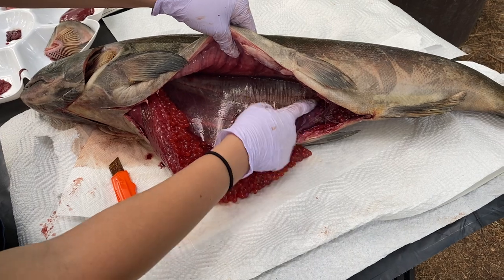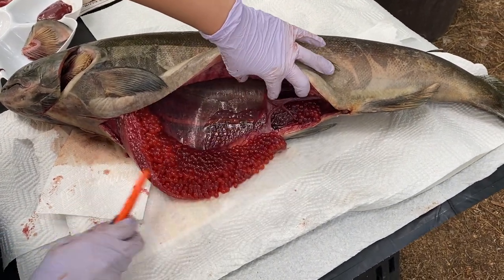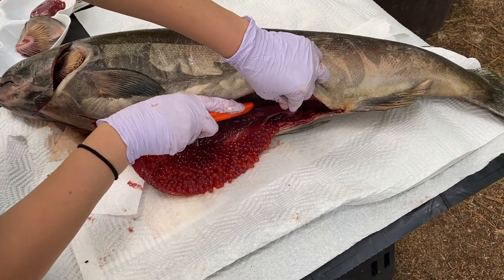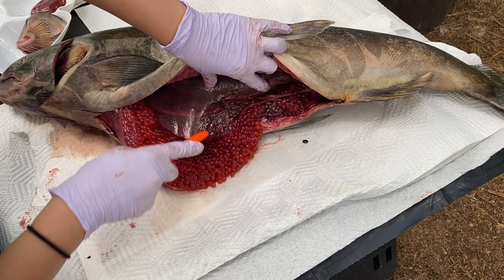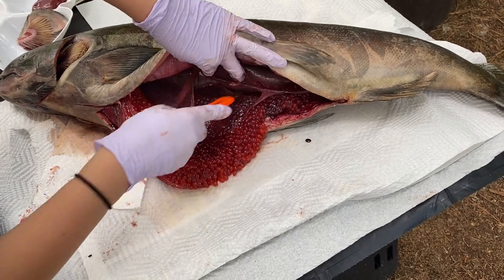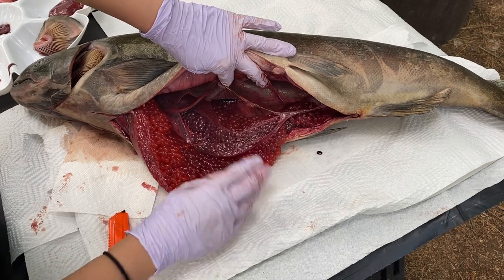And so you can see she has a really big swim bladder too, and then we can open up this side and we can see all of her beautiful eggs. So these eggs would not be fertile anymore or healthy, so they wouldn't be able to make baby salmon just because she has not been alive for a while. But you can see she has so many eggs in her.